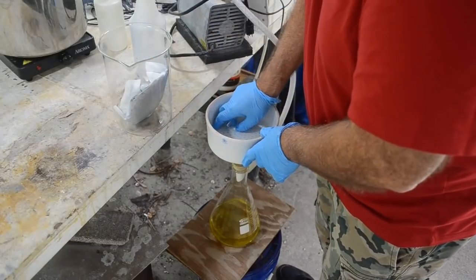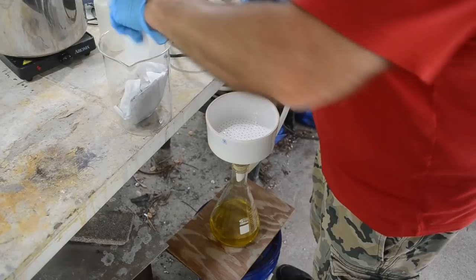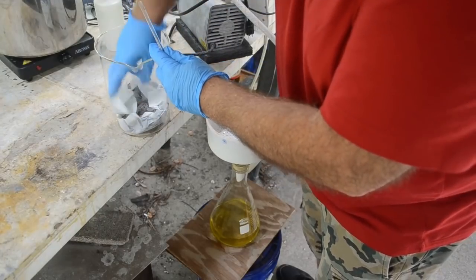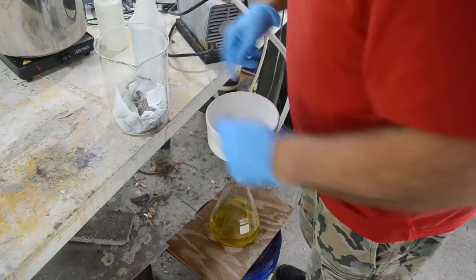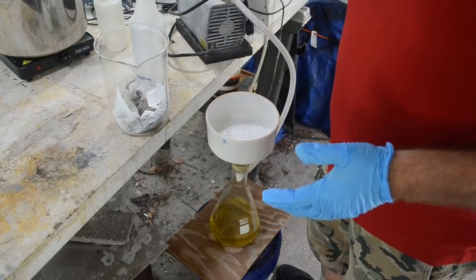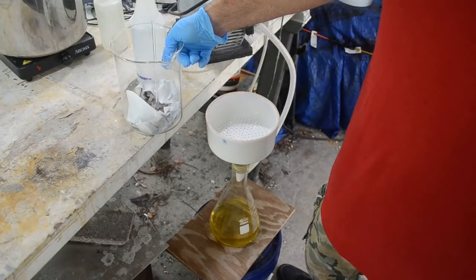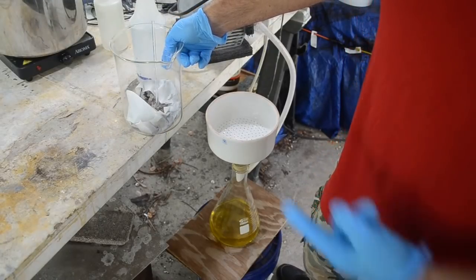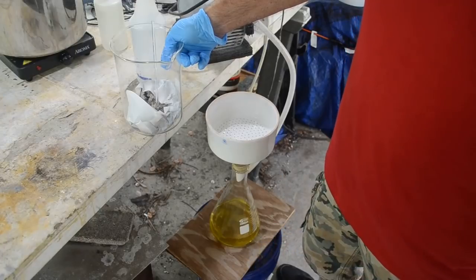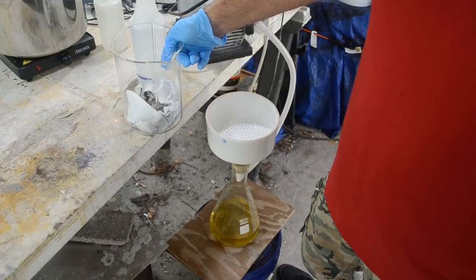And with this filter down here too. I double up my filters in my Buchner funnel usually because the holes in the Buchner funnel are really big. And a lot of times the vacuum will just suck one or two holes right through a single filter, but if I double it up, it's fine. Okay, so this needs to go into the fume hood again. We're going to make some aqua regia. We're going to dissolve the gold in here. Paper pulp should all fall apart, and then one more filtration and we should be able to drop our gold.